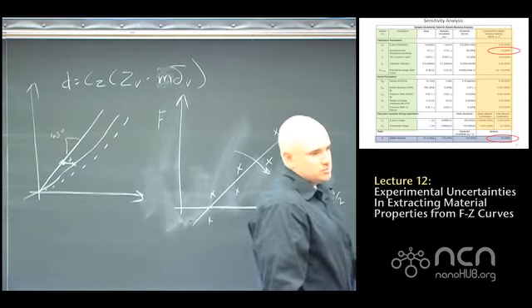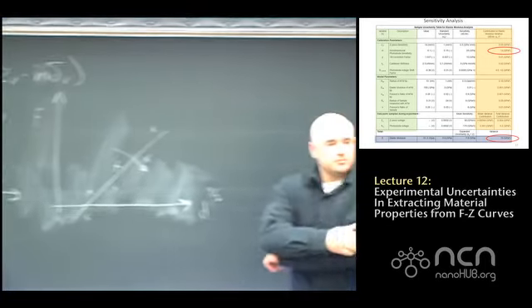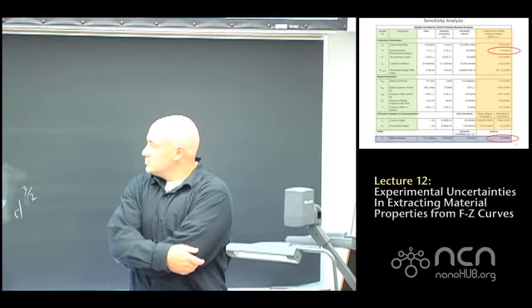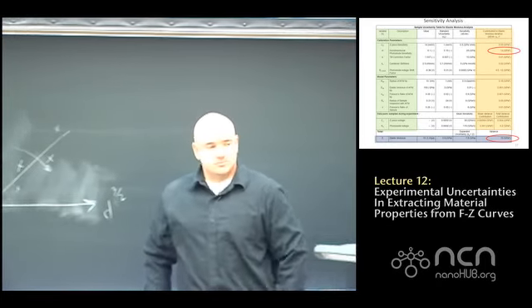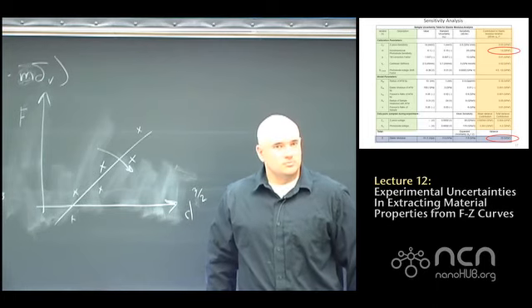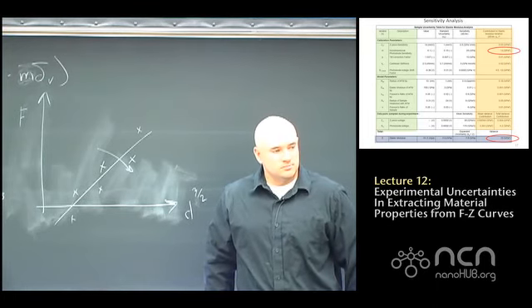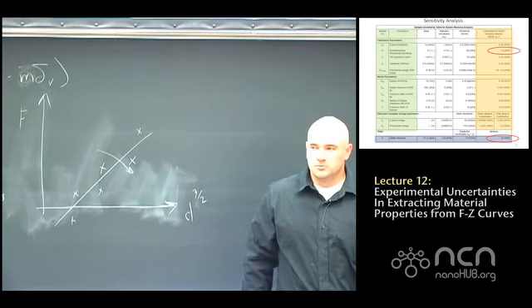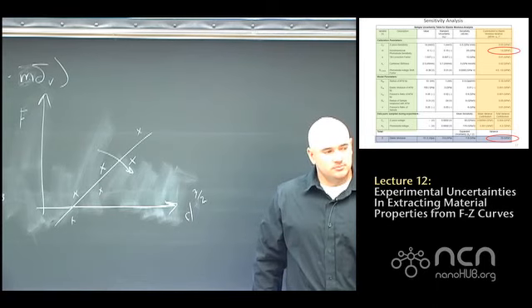The key point is, for many materials, when you do FC on a calibration surface, a really hard surface, we expect this 45-degree line, and you do it on most materials, polymers included. The FZ curve you get on the polymer is not going to be very different from the 45-degree line. It'll be a small change, and then when you do the FZ to FD conversion, you're basically subtracting Z and delta. Delta is due to deflection.